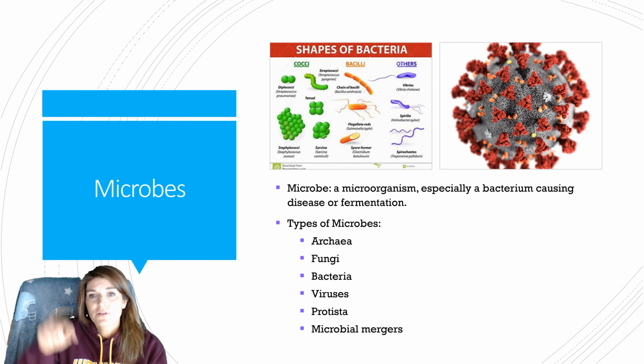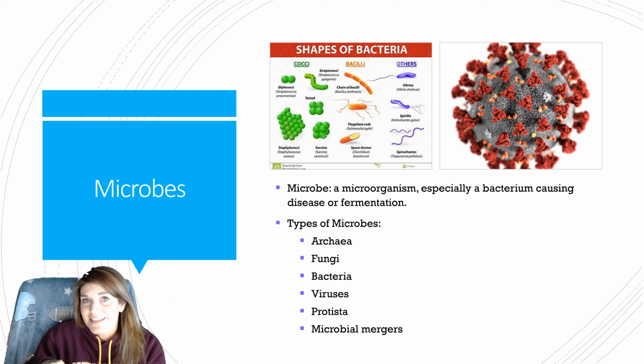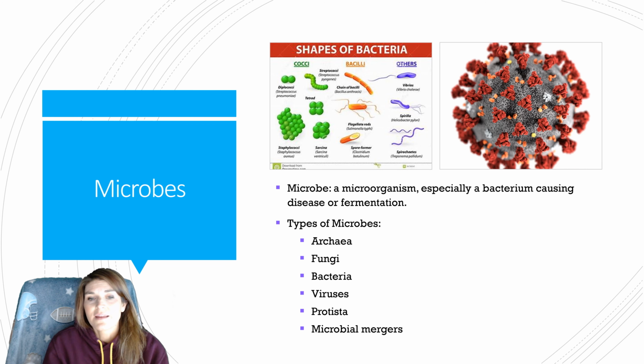So we would also have to, sometimes you'd put multiple types of bacteria on a slide. He wouldn't tell us what it is, and we'd have to go and stain the slide and pick out if they were rod-shaped or circles. So if it's something like streptococcus, which would be like strep throat, those will be little round bacteria. And then there are little rod-shaped ones that are sometimes called bacilli.